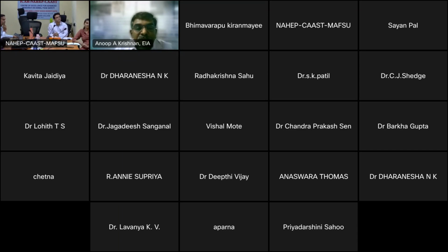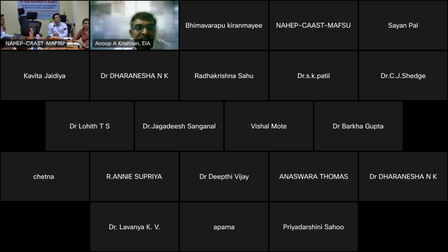Yeah, that's what I also told in one of the previous slides, that if you dilute it too much, the actual analyte will not be targeted. So when the method was developed, we worked with 1 gram, 2 grams, and 5 grams. When we worked with 5 grams and 2 grams, the matrix effect was slightly more. To reduce the matrix effect, we reduced it to 1 gram. However, we were able to achieve all the analytes.